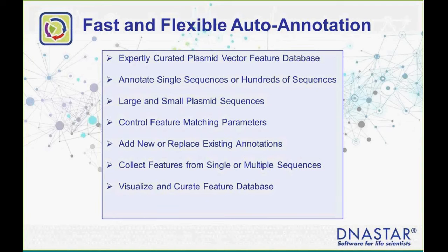This tool is initially intended for sequences up to about a few hundred KB. You might be able to stretch that a little bit larger, but it's mostly plasmids and some of the larger environmental plasmids that you might see. And then there's a UI. So we have a user interface that allows you to interrogate and look at the annotations. So the workflow can be fully automated where you just accept all the annotations, or you can look at them and pick the ones that you want to add to your sequence.